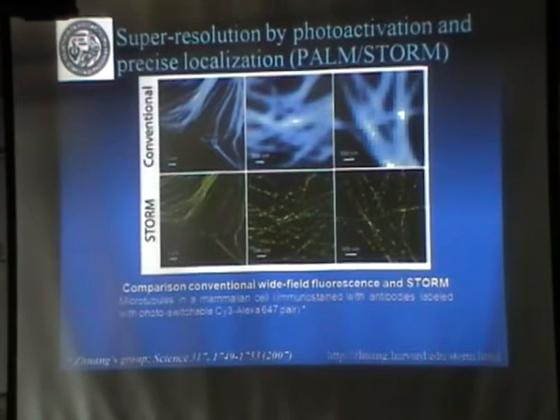There are a lot of details I mentioned. You need to make sure that the table doesn't move. At 10 nanometers, if you breathe around, it's going to change the index of air. So you need to have some way of tracking that things don't move. And in fact, things move and then you correct for it. So the first images took hours. Now they can take minutes, but that's still challenging in terms of the time it takes. One of the goals is to do this faster to live cell image.